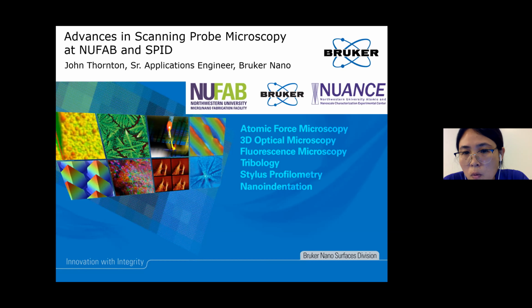We acquired a small version of Bruker Icon inside the clean room. Dr. Gajendra has a few more advanced versions of Bruker AFM. This new AFM in our center has 3 operational modes: the conventional contact mode and the tapping mode, and a third one called PeakForce Tapping mode, which is a very useful new tool. Today we have John here, and mostly he will talk about the difference between the other conventional modes and how it is useful. Hi, Gajendra, do you have anything to talk about your side?